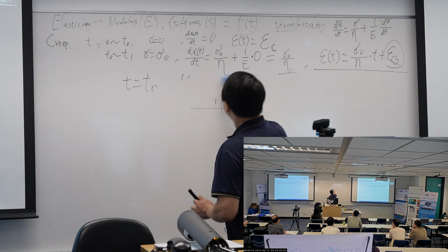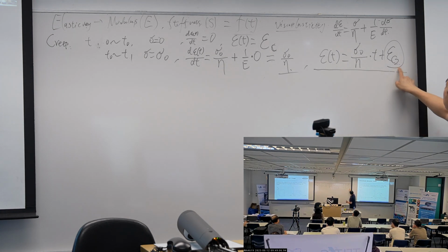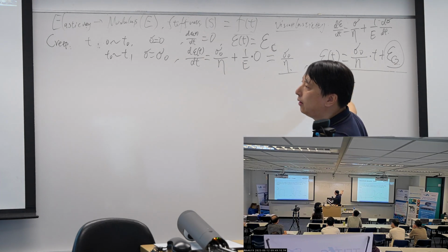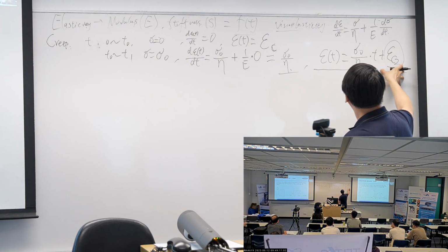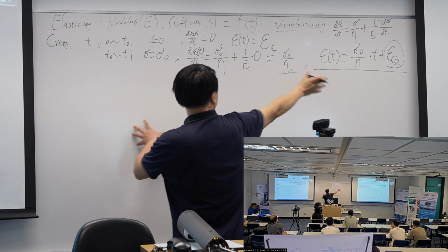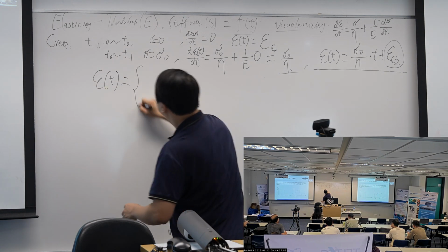I'm sorry, I have to leave it here because the epsilon C2 needs to be measured by other conditions. There should be some left term here.